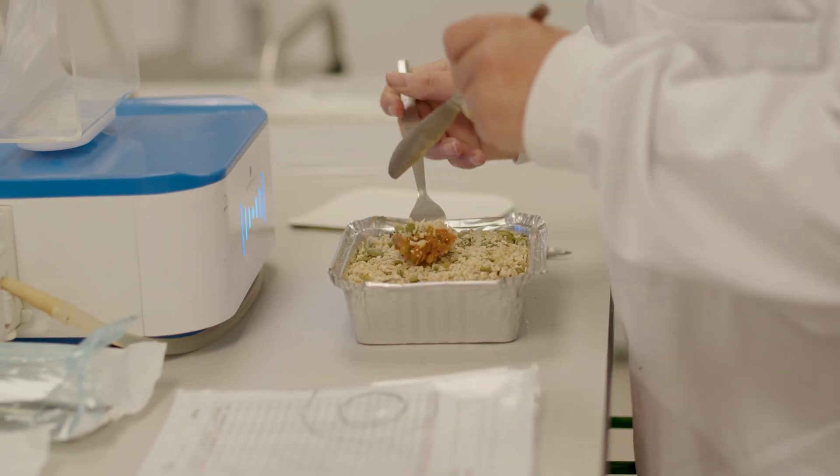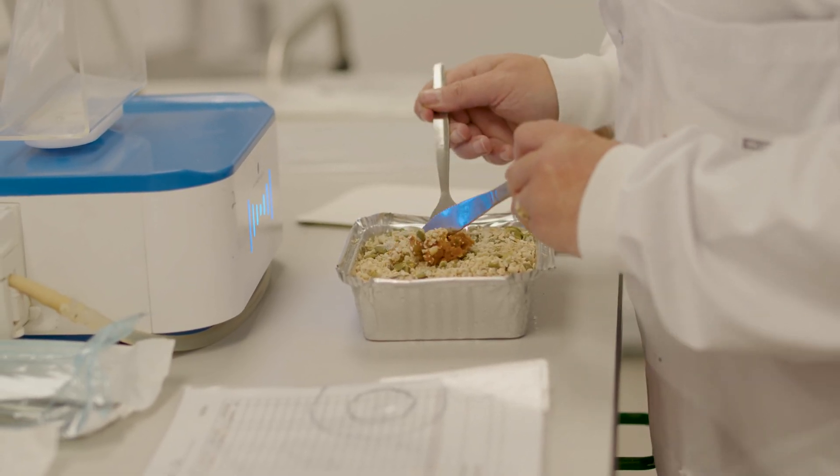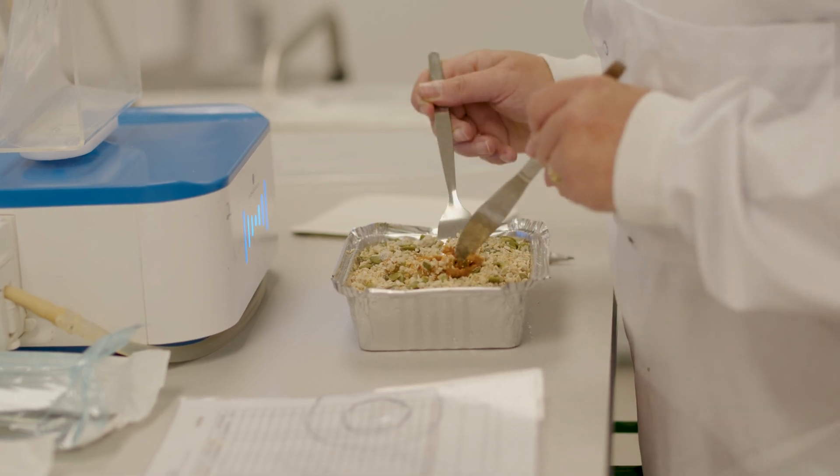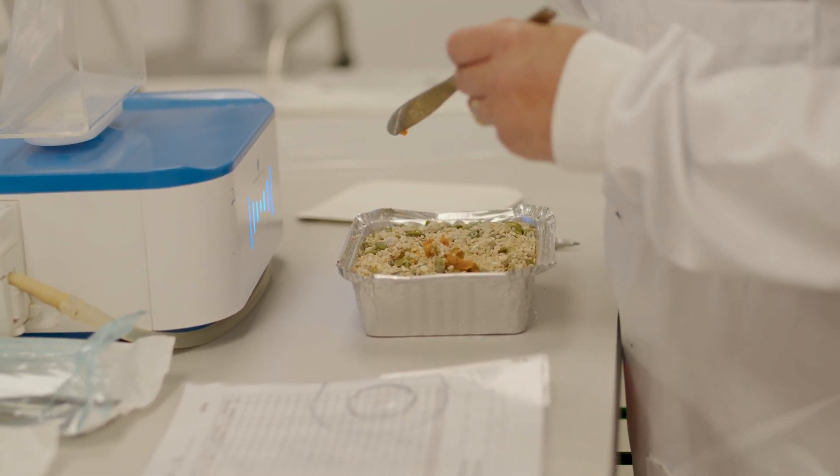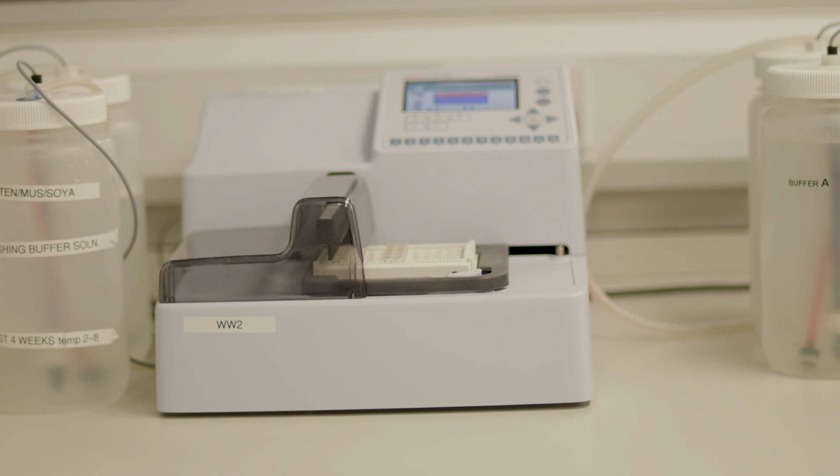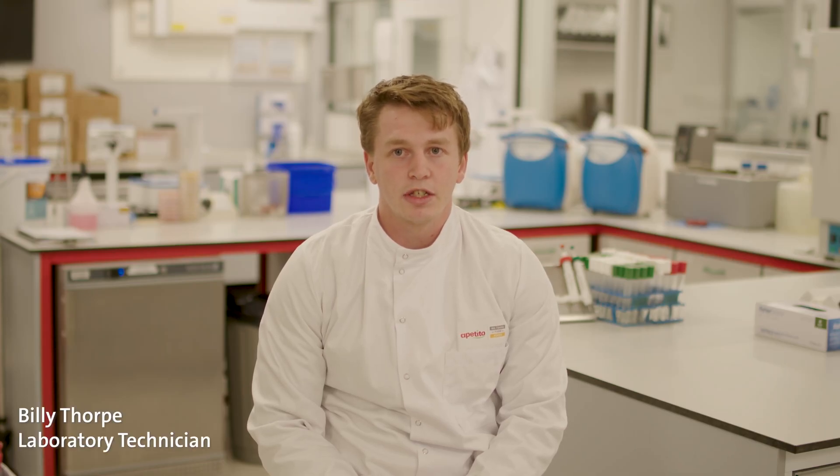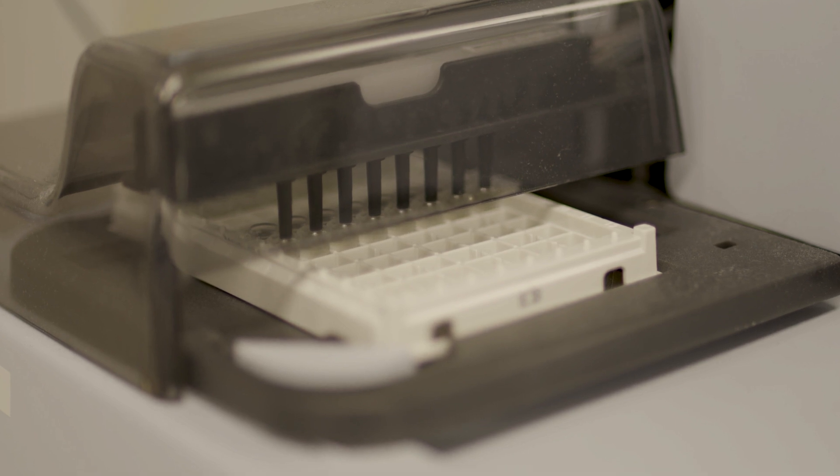The microbiology area tests the food we produce on-site to make sure there are no dangerous levels of bacteria present. The allergen room tests for certain allergens such as milk, soya, egg, and fish to reduce any chance of contamination to our customers.